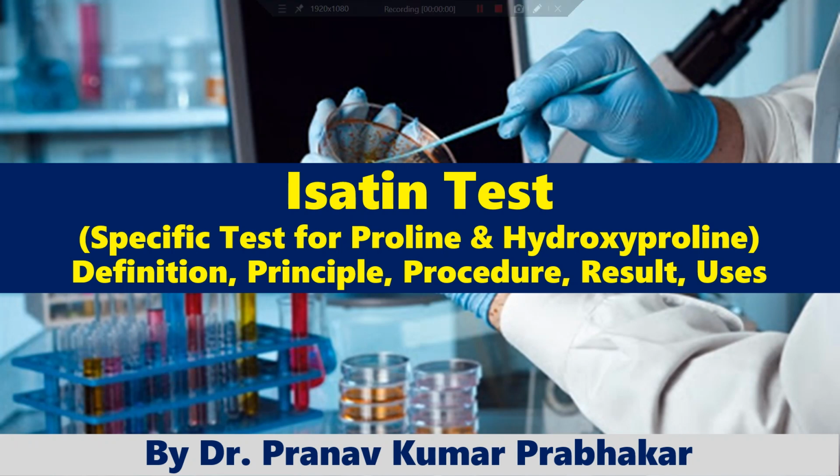Not exactly amino acid, they are imino acids. So certainly proline and hydroxyproline will not be detected by a common test, which is normally for amino acids. So for that one we have a specific test that is called the Isatin test. So let us understand what this Isatin test is.